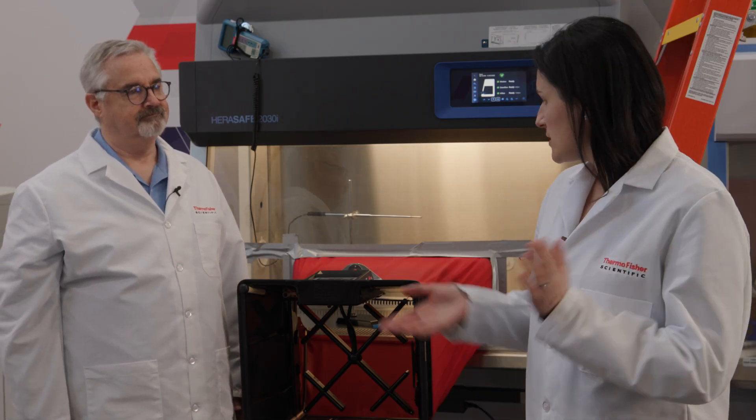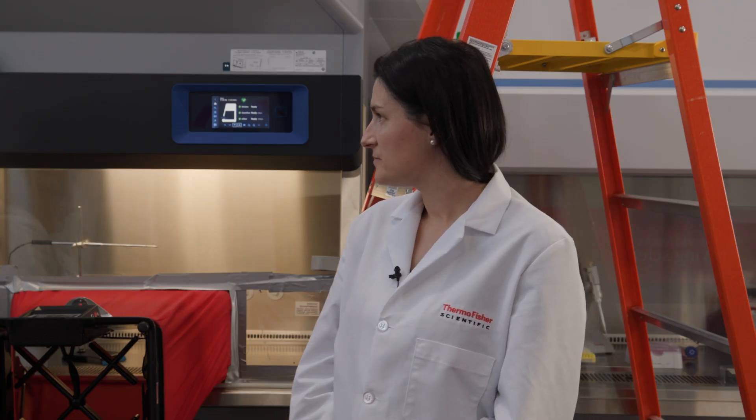Hi Dave, what do you have for us today? One of the really cool features of this new generation of Class II Biosafety Cabinets is airflow compensation. Airflow compensation helps biosafety cabinets maintain airflow while filters are loading or other interruptions are occurring. This is a big deal because it is the airflow that keeps biohazards in and room contaminants out of the biosafety cabinet.